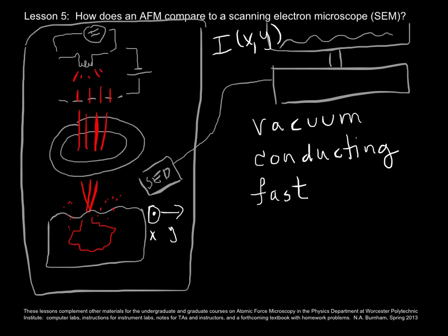You get real-time data acquisition, and it's very maneuverable, such that you can get an image of the entire sample, like on the order of centimeters, and then you can get features on the order of nanometers.